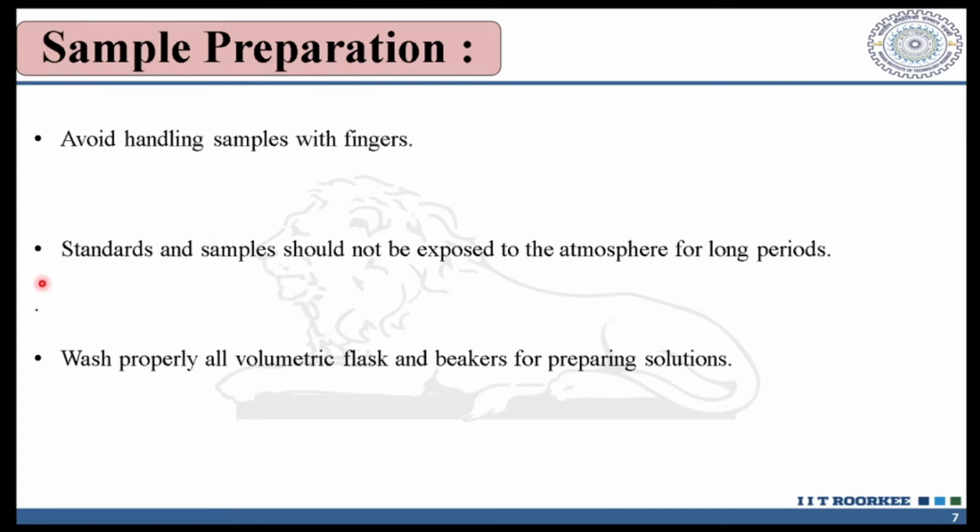Second, standards and samples should not be exposed to the atmosphere for long periods due to contamination from airborne particles and the evaporation of the solvent, which could lead to elevated concentration. You have to wash properly all the volumetric flasks and beakers for preparation of solutions.